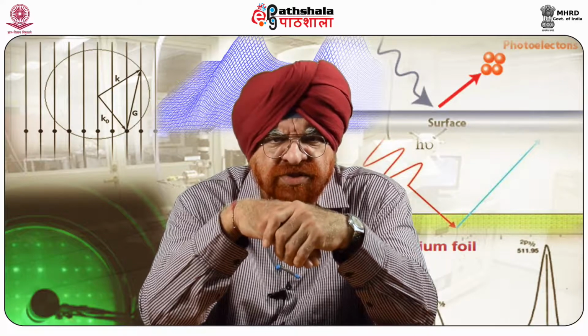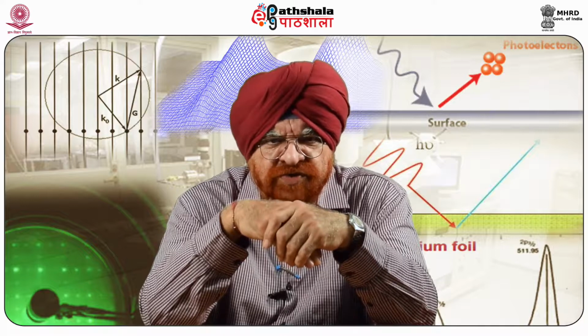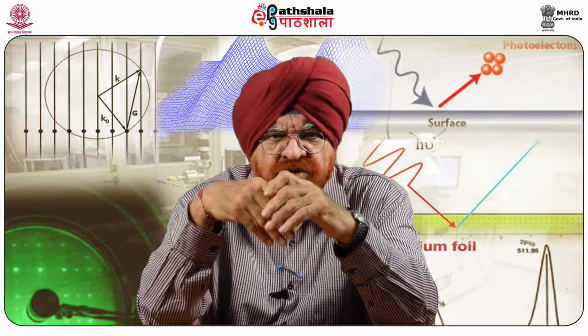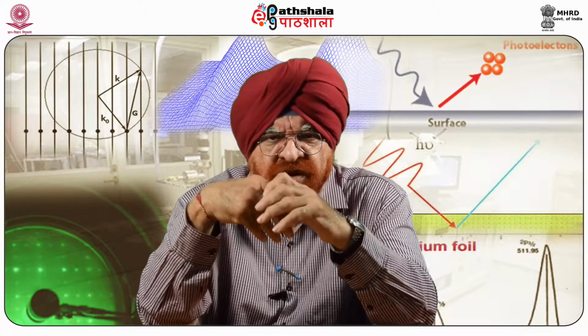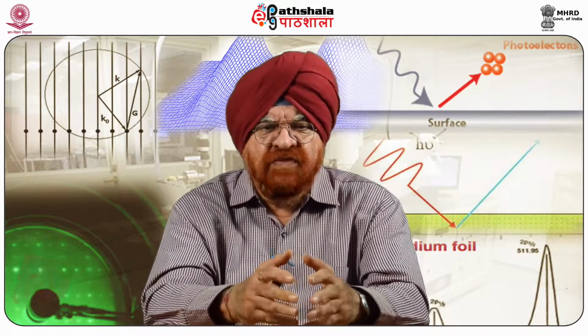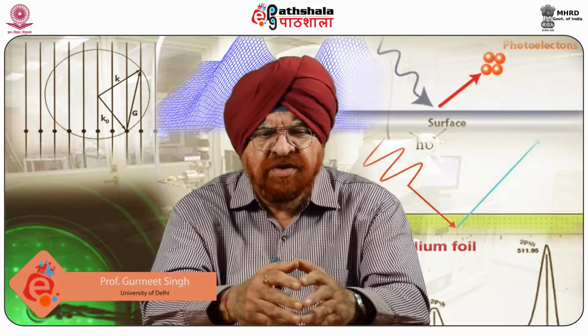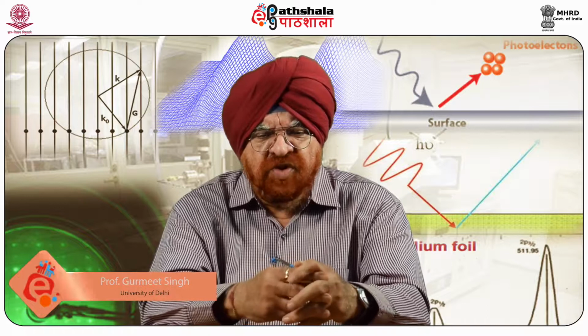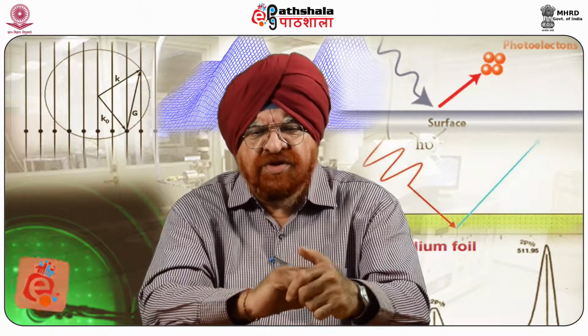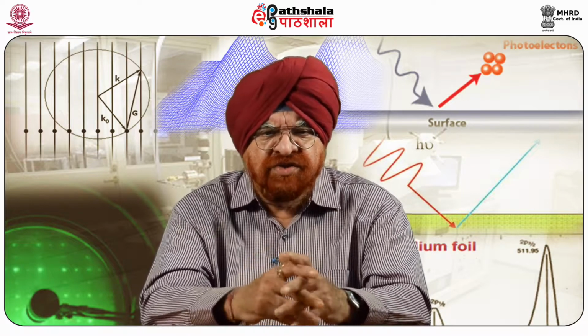The interaction strength is then determined by monitoring the motion of the cantilever using a sensor. Although a lot of effort has been made in order to get quantitative information, magnetic force microscopy is still predominantly a qualitative characterization technique. I am sure you would have understood the importance of this MFM technique when we carry out the analysis of the surfaces.